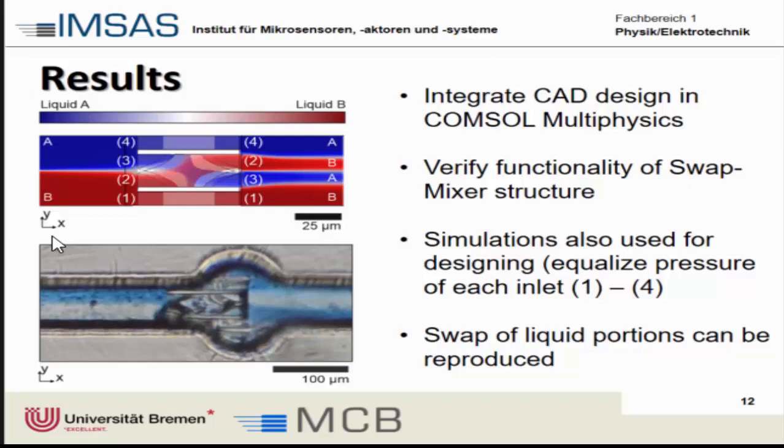The height of these bumps in channels one and four can be reiterated: we can adjust the design, run a simulation, look at how the flow rates through these channels are, and then optimize that to ensure the correct liquid portions are reproduced.